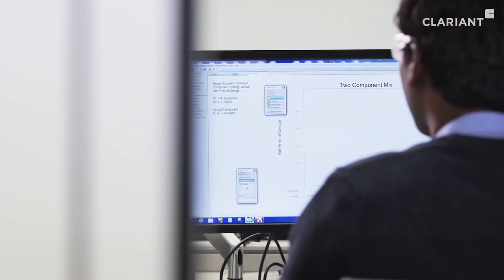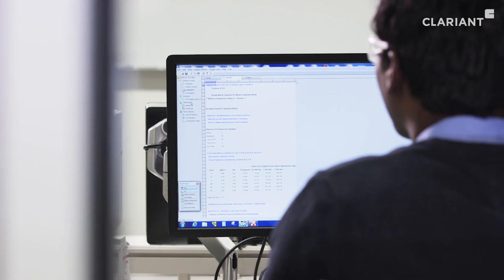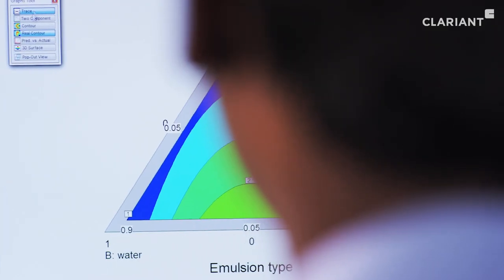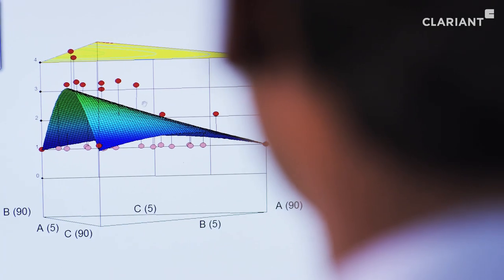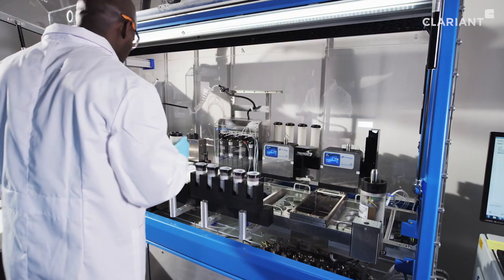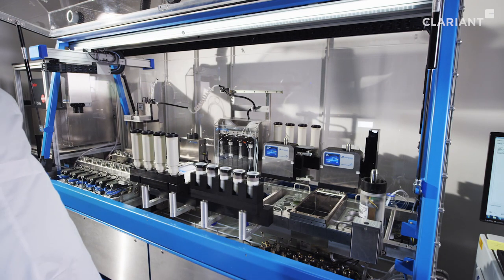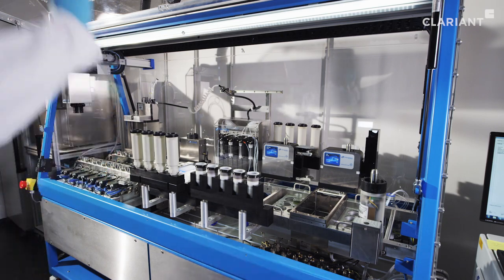A typical process in our lab starts with the experiment design, often using design of experiment techniques. This is then transformed into automated protocols for one of our robotic platforms. Next, the selected platform must be outfitted with required tools and chemicals to complete the experiment.